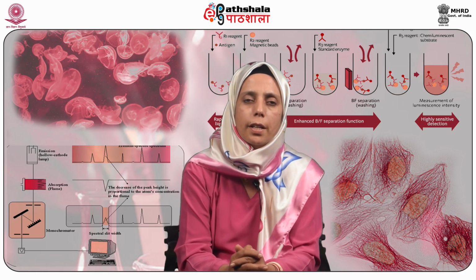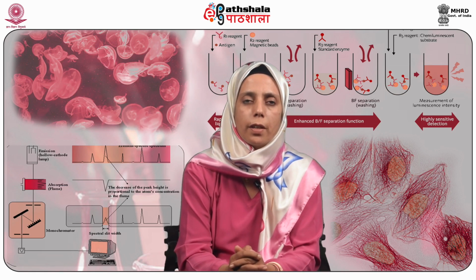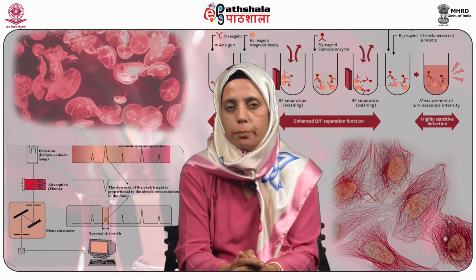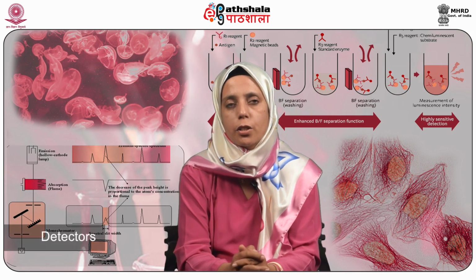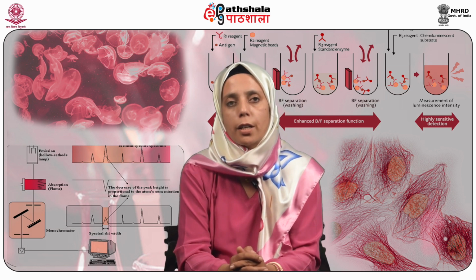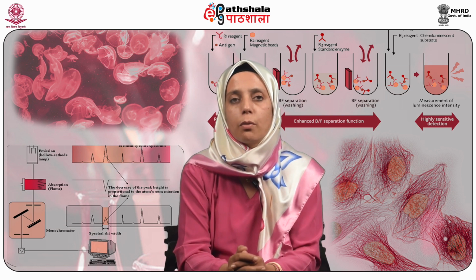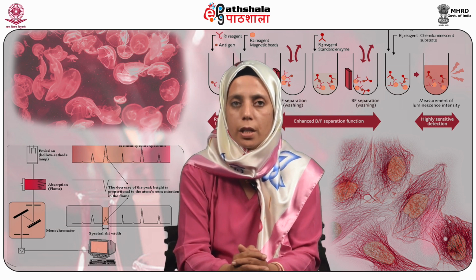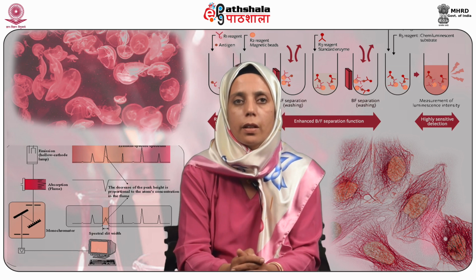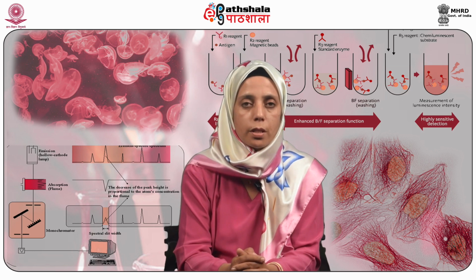So after selecting the particular wavelength, it is important to detect it properly. The detectors used should have certain important characteristics. That includes, it should have good response to the wavelength of selection. It should have good quantum response.